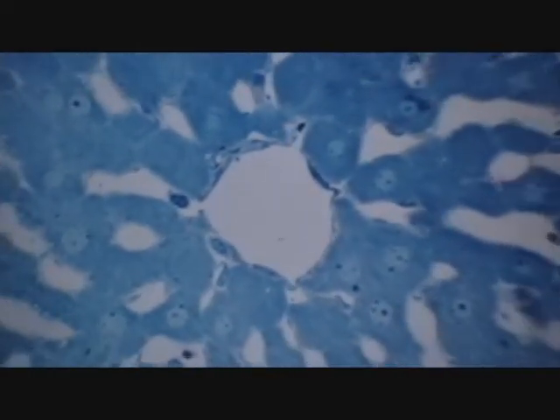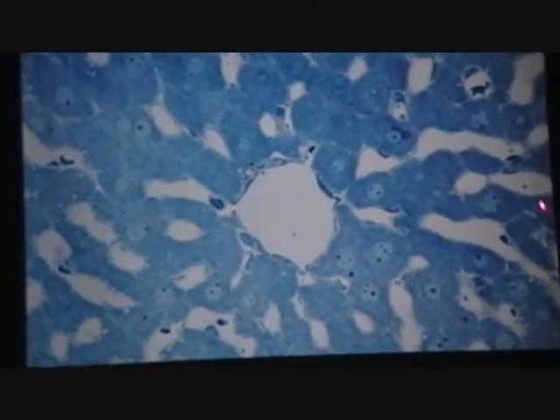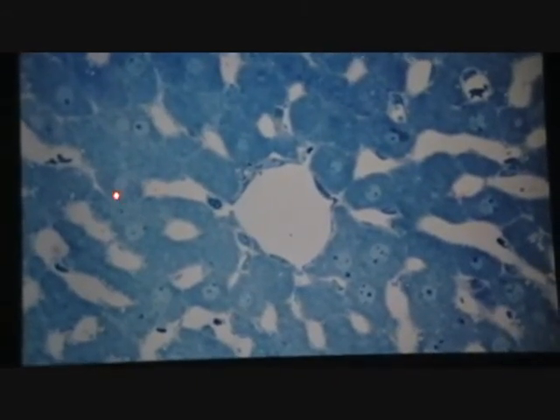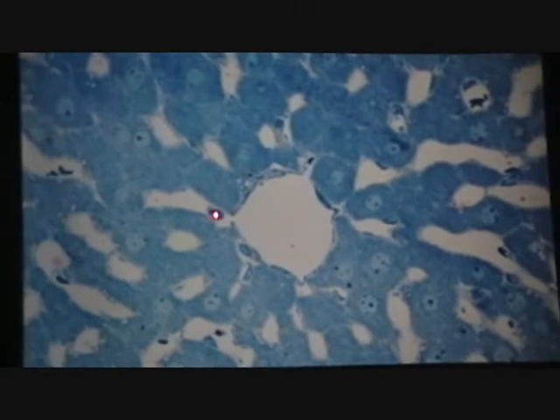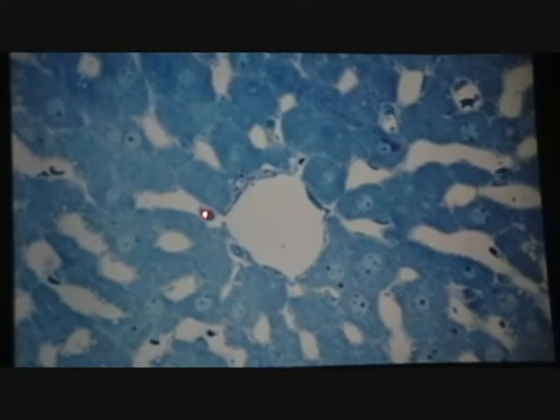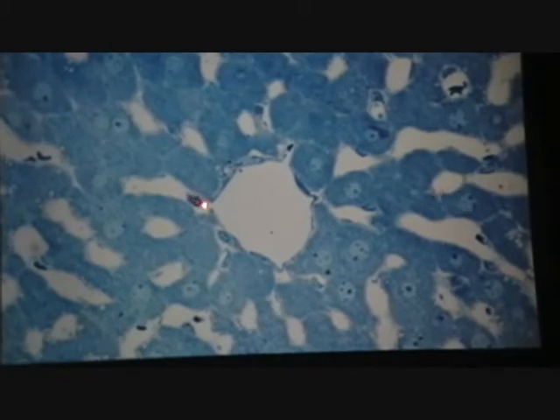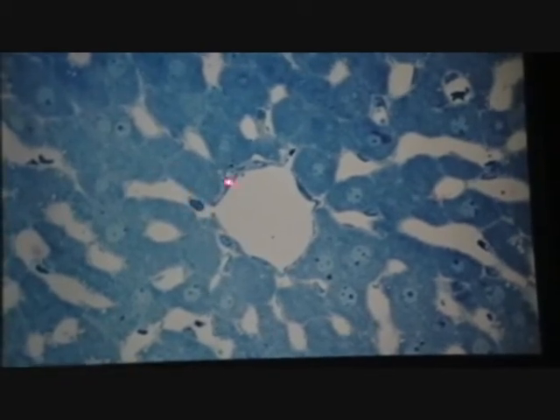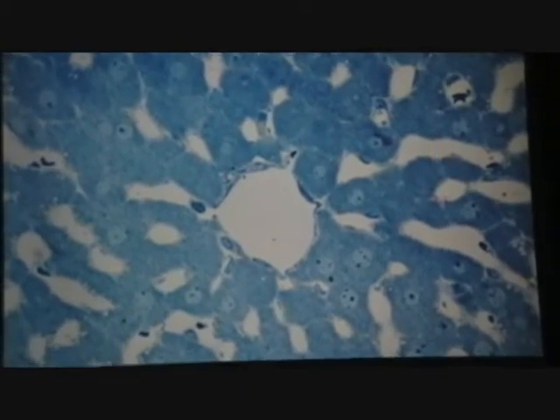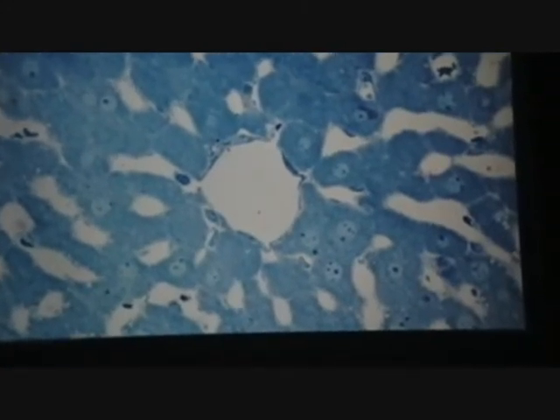So where is this from? Liver. Liver. Sure, all the way. A little magnified with a central vein. You got your cords, got your sinusoids. What's this? In the sinusoid? Kupffer cell. Yep. So these are Kupfers if you see nuclei sticking in those sinusoids. But this is just crystal violet, just a different stain turning it blue. But that shouldn't throw you. Still has everything to tell you it's got to be liver.